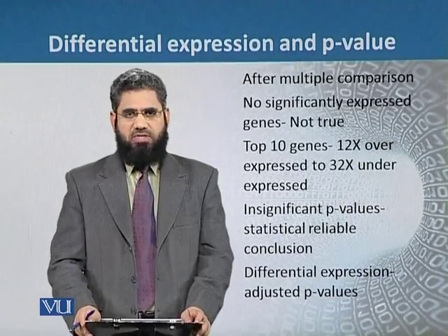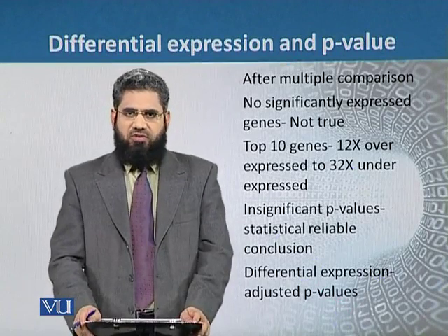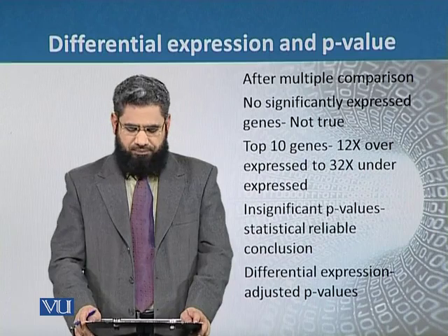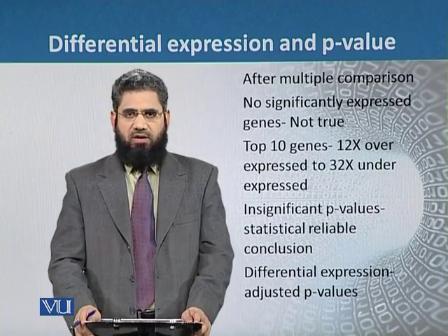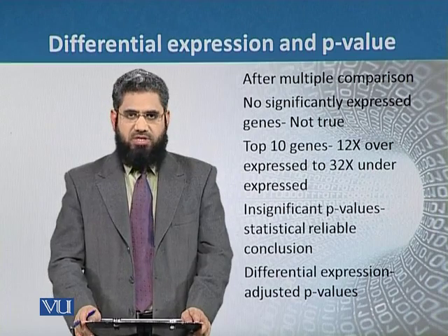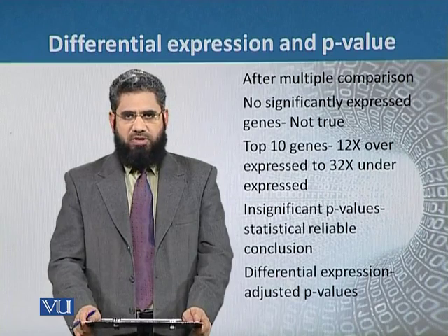In this module, we will see the differential expression and the p-values. As we remember, in the previous modules, we have seen that when the correction of multiple comparison was carried out, we could not get any significantly expressed genes. But maybe this picture may not be true.